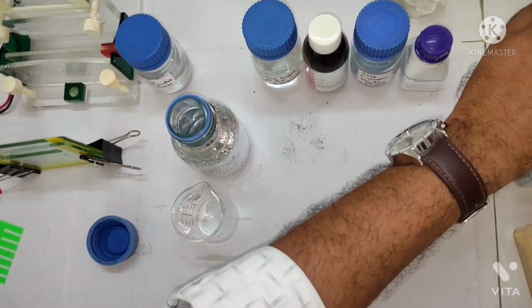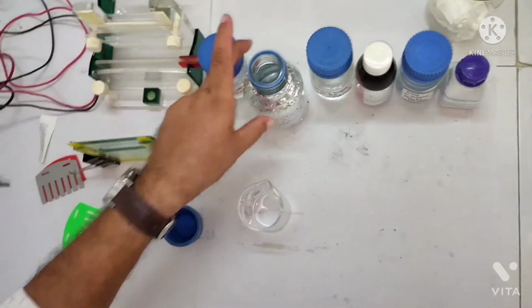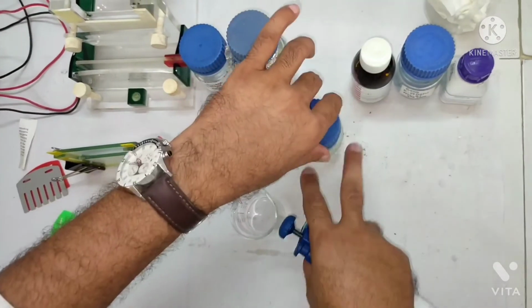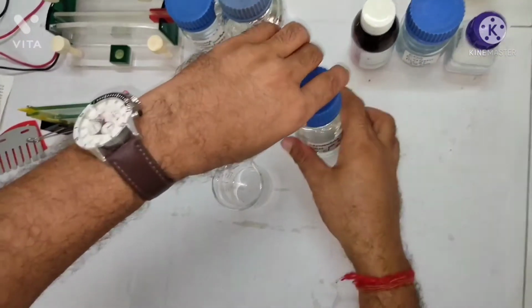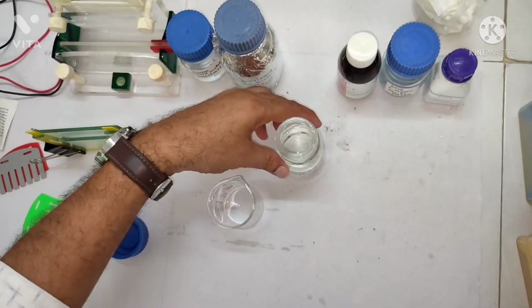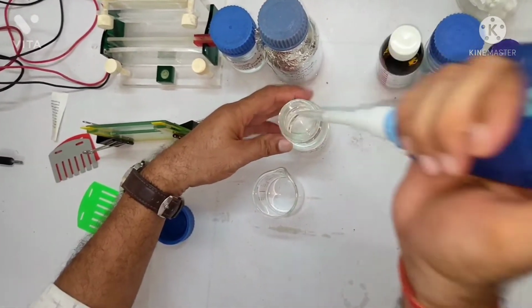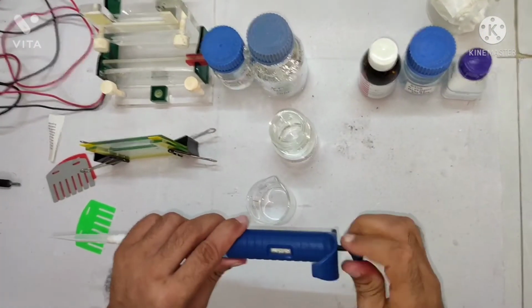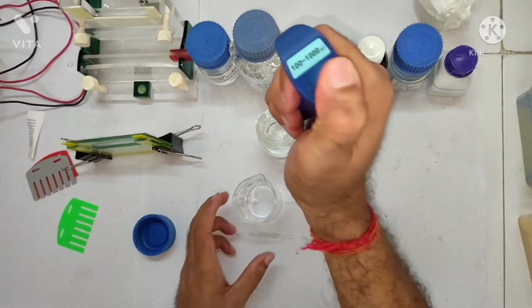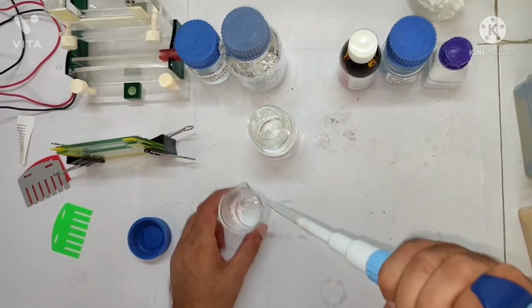1.5 molar, right? That is called separating buffer. So acrylamide, this is done. So you cap it. You always keep your chemicals in front of you so that you can prepare the separating gel. Okay, now this is the separating buffer. So we have to add 2.5 ml separating buffer. So I am adding first 0.5 and then we add 2 ml. So this is 0.5. So this is 1.5 molar pH 8.8 separating buffer.